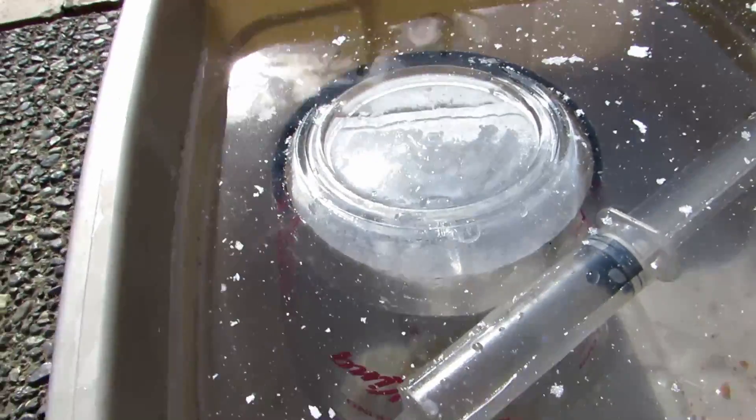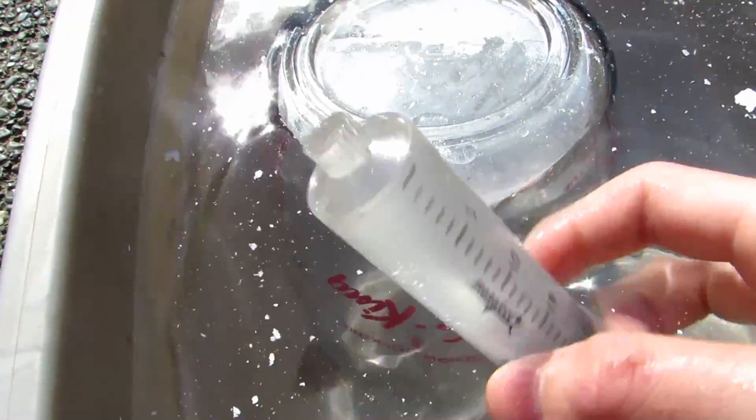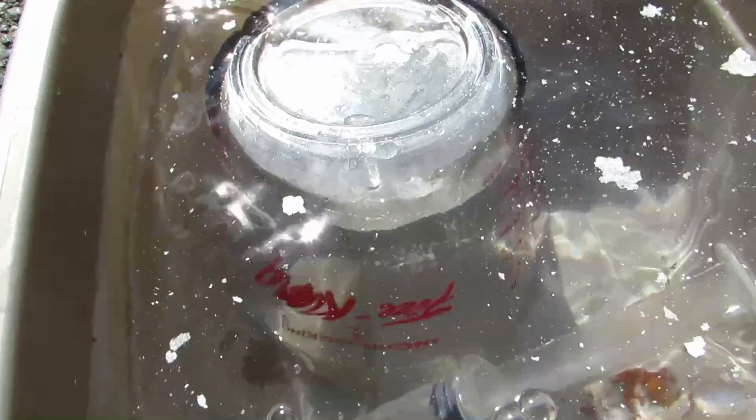Now we just have to lift this container back up and stick the syringe in, squish out all of the water, and suck the argon in. Water just ensures that there's no air inside of the syringe so that we'll get a pure sample of argon. Once I have a syringe of argon, I'll be right back.